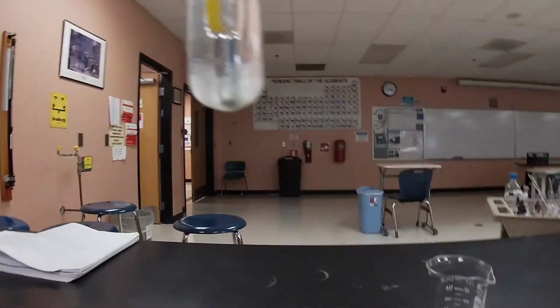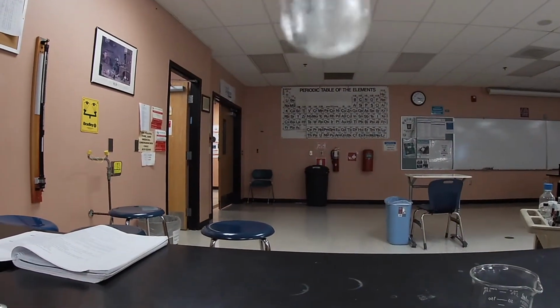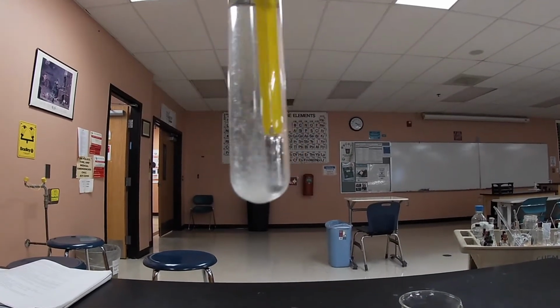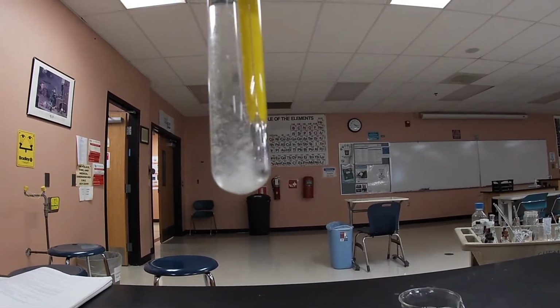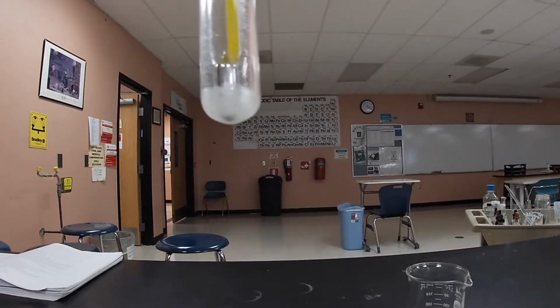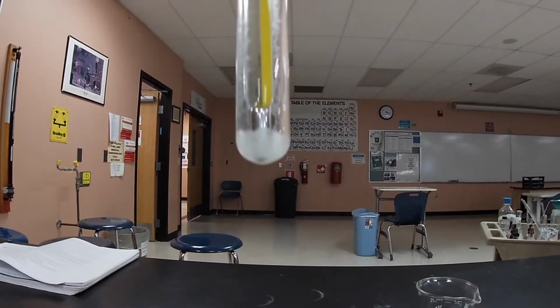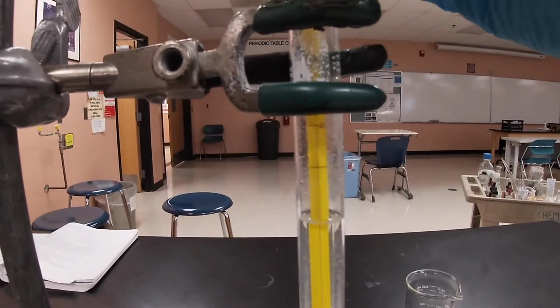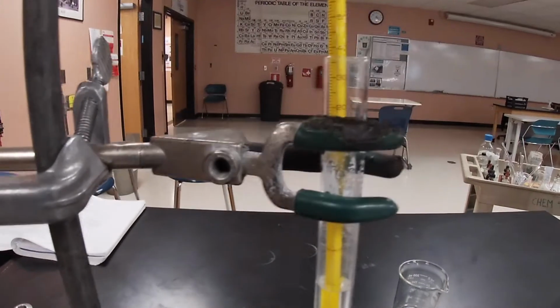And again, that's the temperature at which you have these beautiful, nice crystals. It definitely did crystallize a lot faster. Again, probably because of the amount of potassium nitrate that we have in there. Okay, so again, temperature is at about 40. We recorded about 48. Okay.